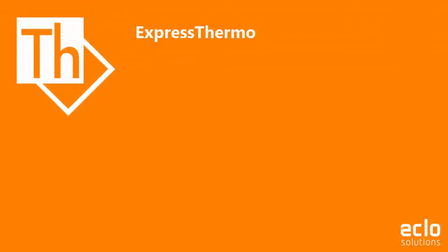This concludes the tutorial on the optional MKT calculation module.